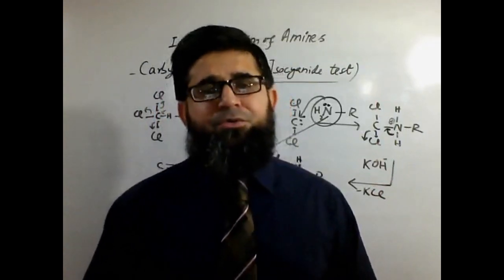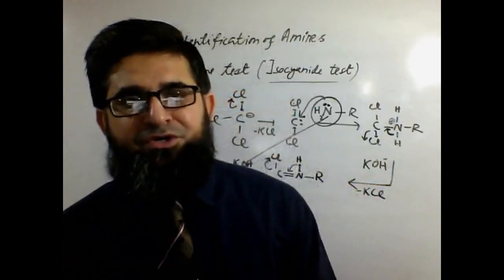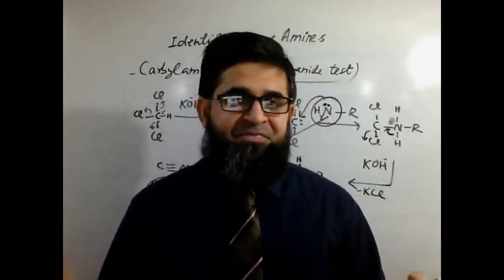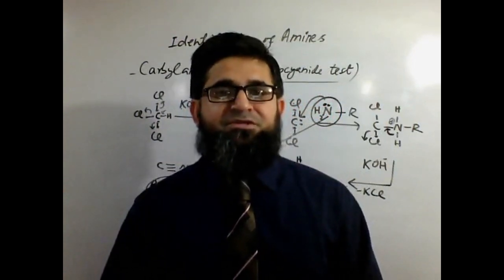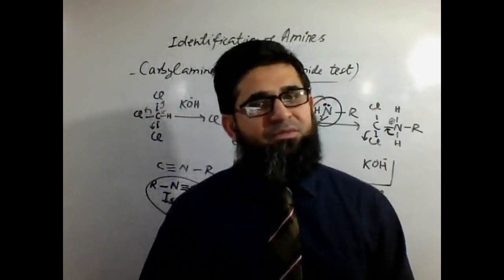Why do we need to identify primary amines? As a first response, being a student, you should have an idea how to identify any unknown given compound, acidic or basic. Let's say if the litmus solution confirms basic, then yeah, you need to do either diazotization or carbylamine.